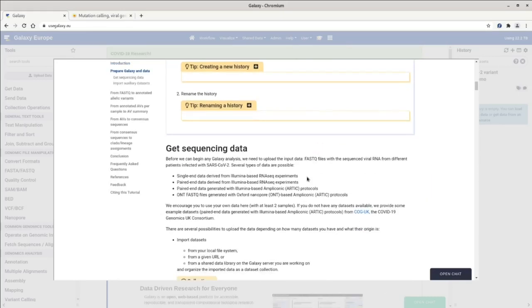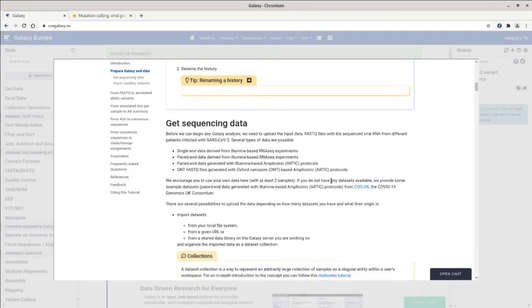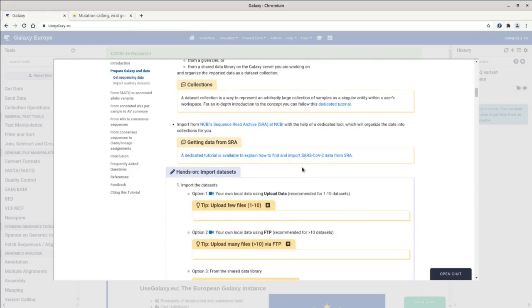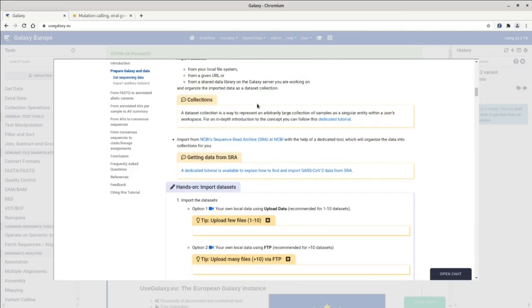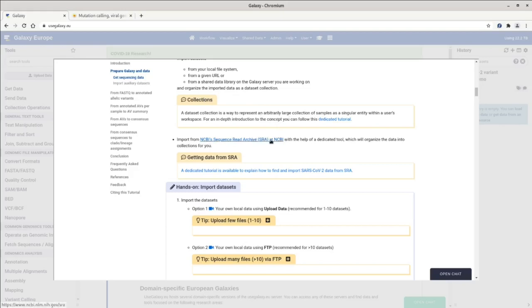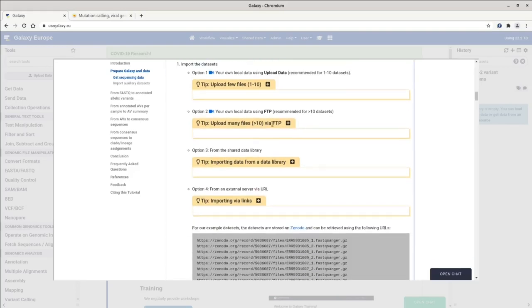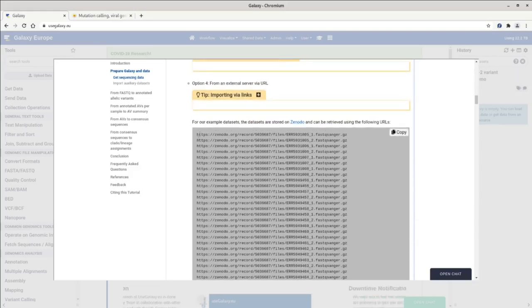The next step is to get some sequencing data to analyze. I'll use the example data suggested by this tutorial. There are many ways to get sequencing data into Galaxy: directly from the SRA via a dedicated tool, through the Galaxy Upload Manager in the web browser, via Galaxy's FTP server, from a Galaxy data library, or via publicly accessible links — which is what I'm going to do here.